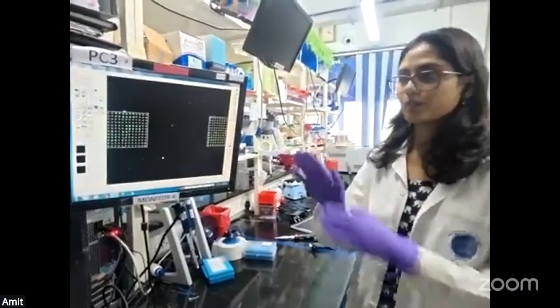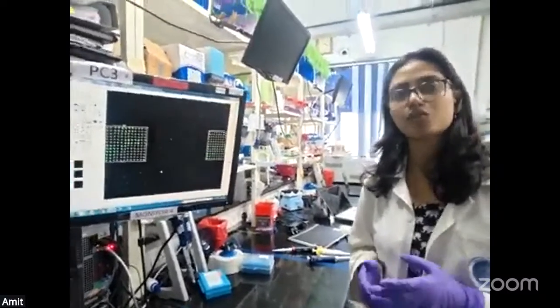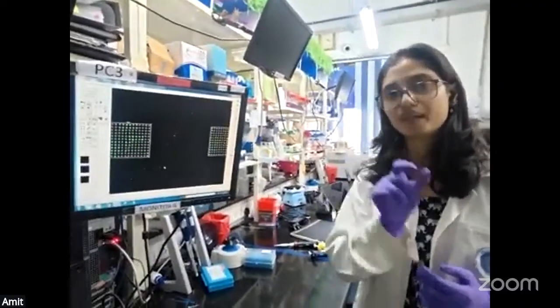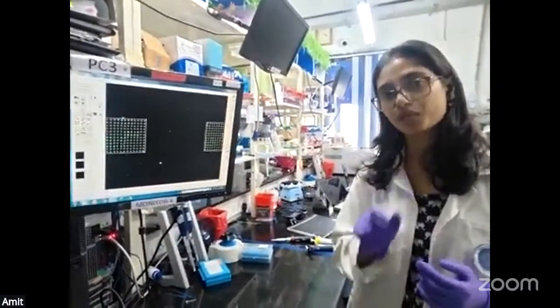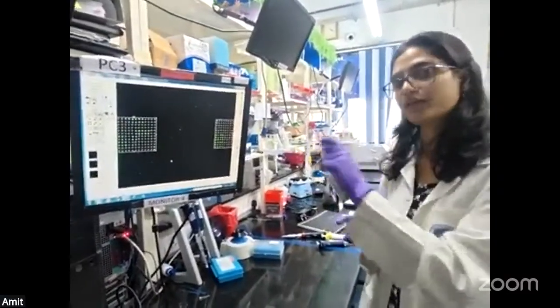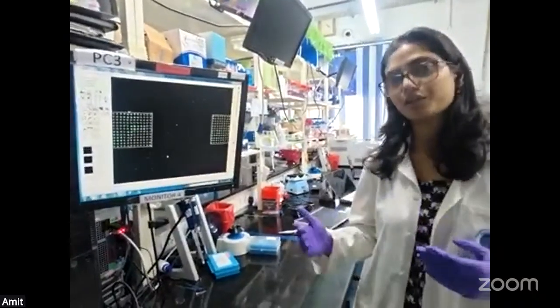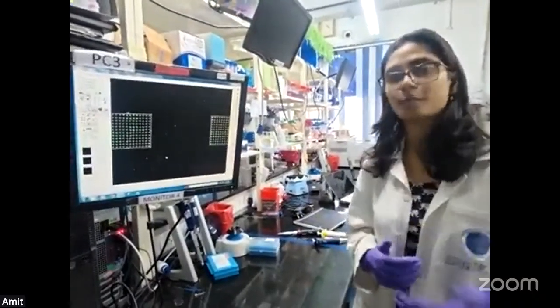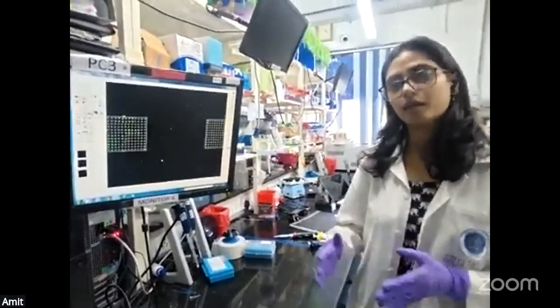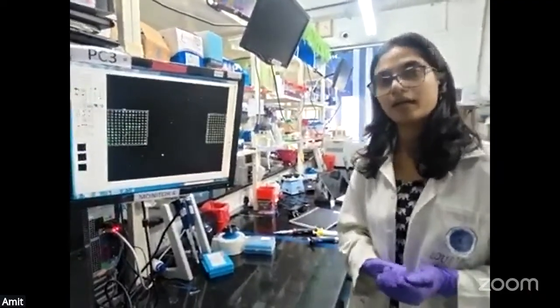So this software gives us a file called GPR file, which is GenePix result file. In that result file, we will have the intensity values of every feature of every protein that is immobilized, that shows the signal in every spot. With those values, we can analyze our data further using various tools, such as Python and R programming, and we can shape that data as per our project or our analysis.